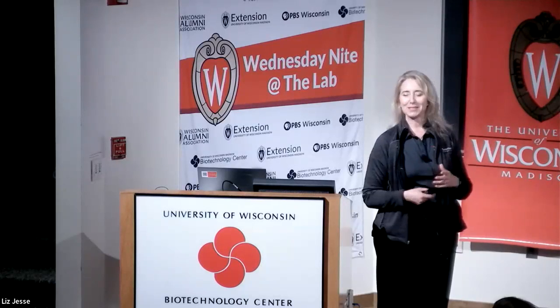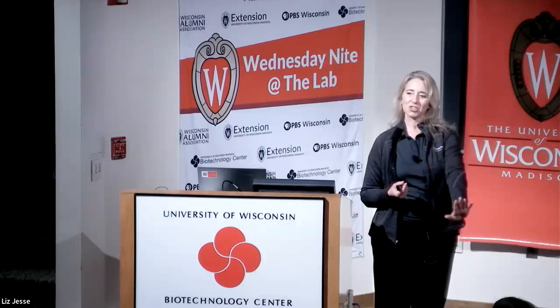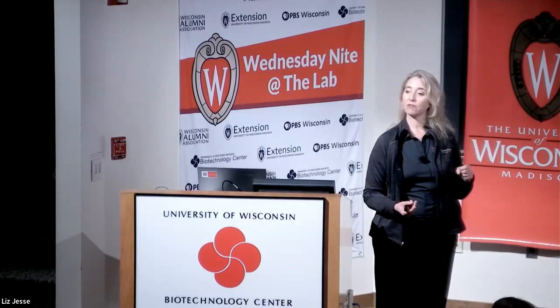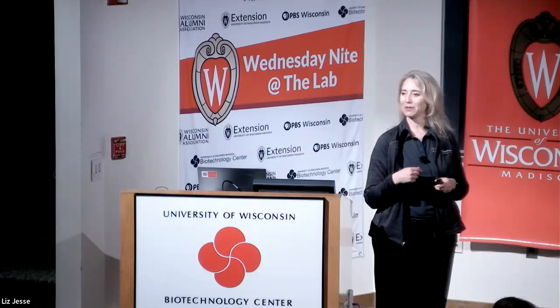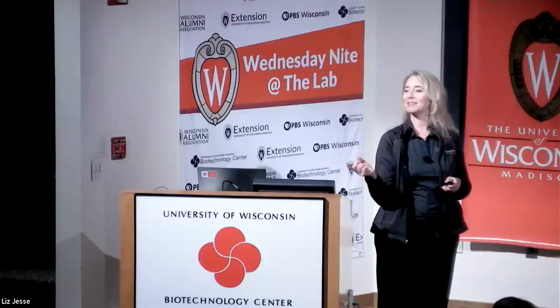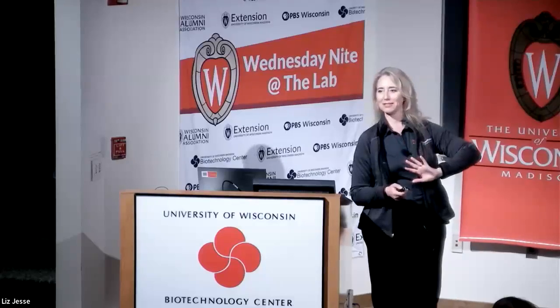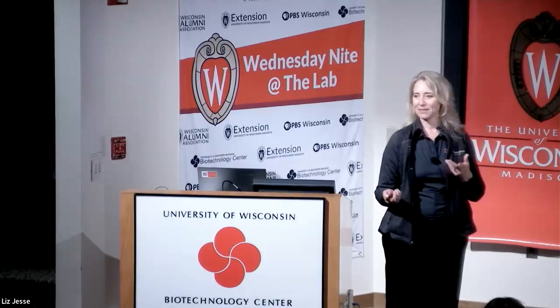Now, because of throughput, the question becomes, what if I don't want to do this all day long? It is not a technology yet available, but if business does pick up at the core, there is a new robotic system that literally just has a tower of plates. And because each plate is barcoded, you determine what that parameter is for running cycles. You just load it into the robotics and it will load all day by itself, which is why we've created that stability of 72 hours. So the auto run will run for 96 hours. So the BioGarage doesn't need to do anything except just stick the plate in the slot and go. But that's how we address that.